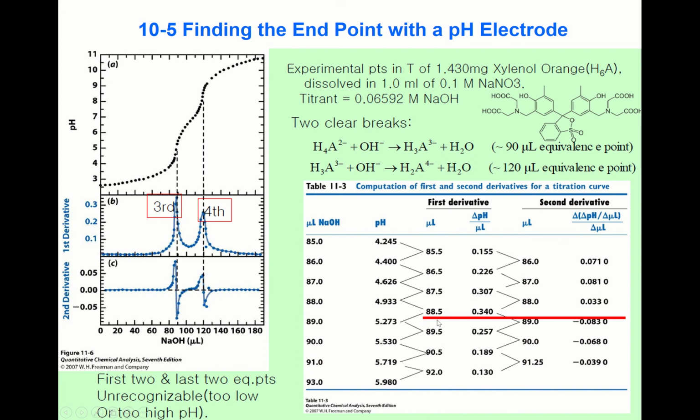Of course, this is not absolutely exact, because you added volume in 1 microliter steps.